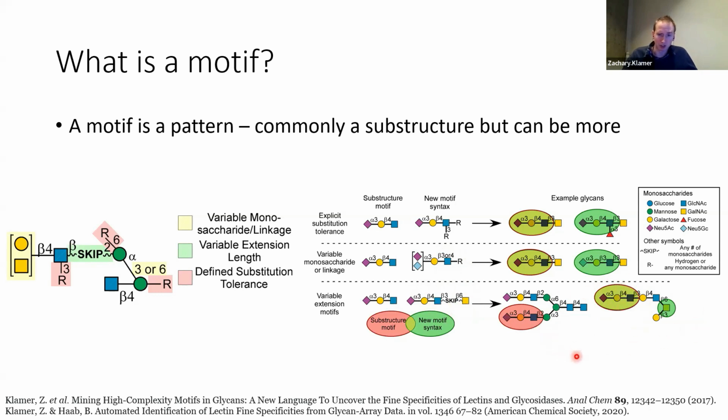And this is as far as the original motif finder went. It was an interactive process where you define motifs and you test them, which is a really useful tool, though it wasn't practical for routine use or non-expert use. So we went further.